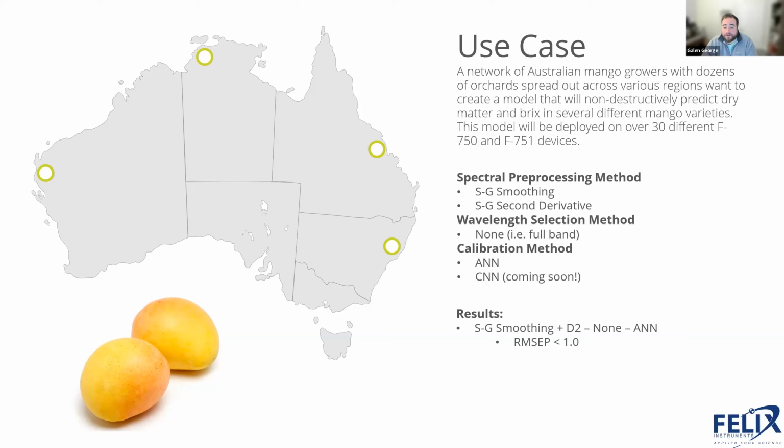And they want to be able to deploy this singular model on over 30 different devices. And they want those devices to be going out to all these different regions and taking measurements, and they want them all predicting fairly similarly.